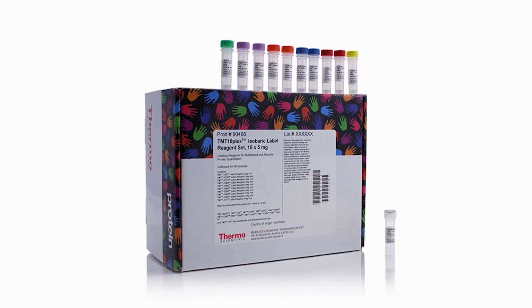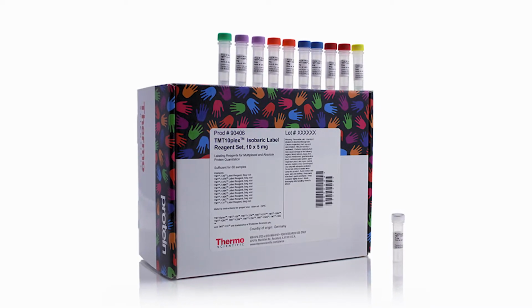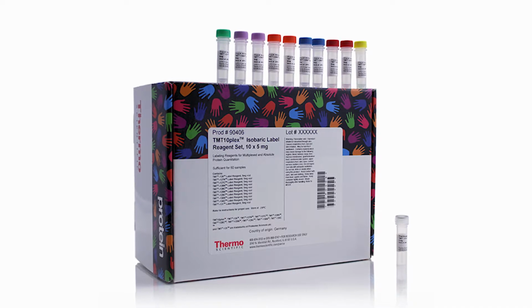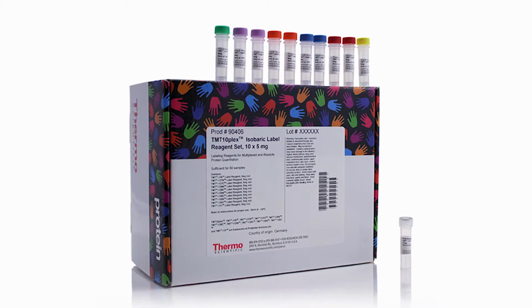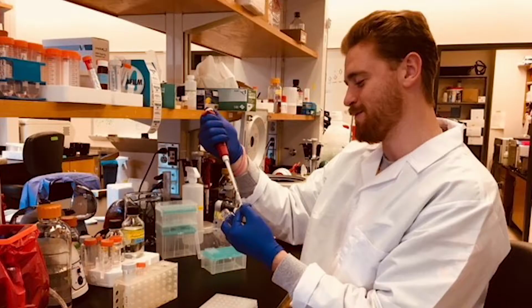Whereas with isobaric tagging using the tandem mass tag approaches, we've been able to label a pooled standard that allows us to control for quantitation by batch over a number of samples. And the other thing it lets us do is to deeply fractionate the peptidomes from multiple samples simultaneously. And this gives us enormous depth of the proteome, which we like because we can now go from, instead of 3,000 proteins from an individual, to about 8,000 to 10,000 proteins from a single individual sample. And now we can do this over hundreds of samples.